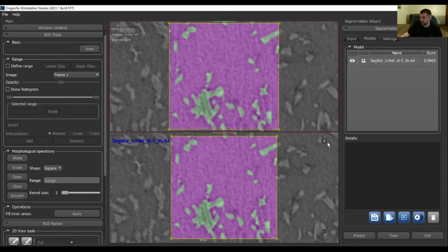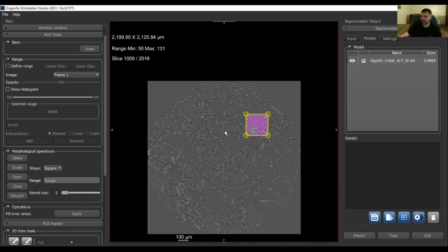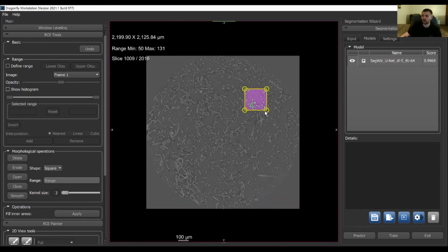So I'm not going to click this because this will actually promote this image up to this training slice. I'm just going to double click my image and go back to my main training session. And so now I have one frame done.